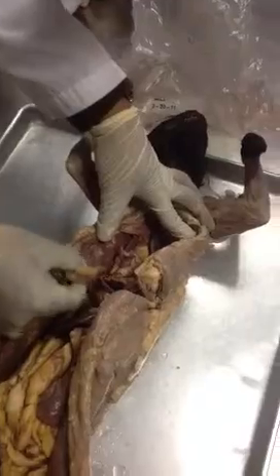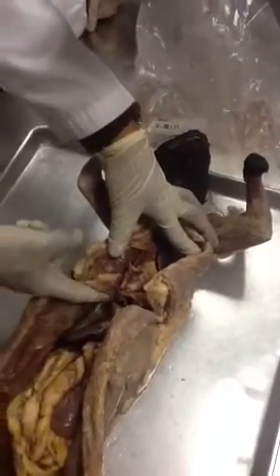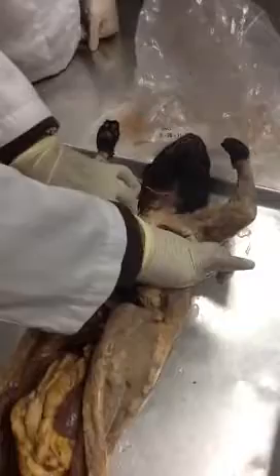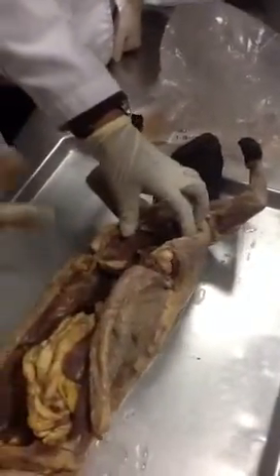Can you see the diaphragm? The diaphragm sees us. Yeah, the diaphragm sees you. And this is the diaphragm. You can also see some of the blood vessels, but we are done with that, so I'm not going to show you the blood vessels this time. Alright, what is done is done.